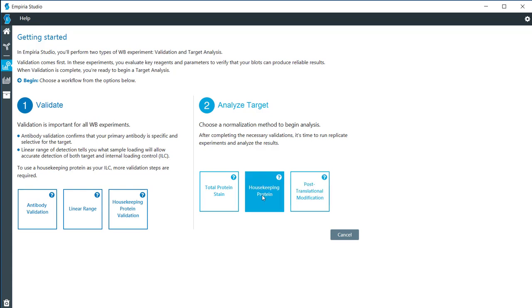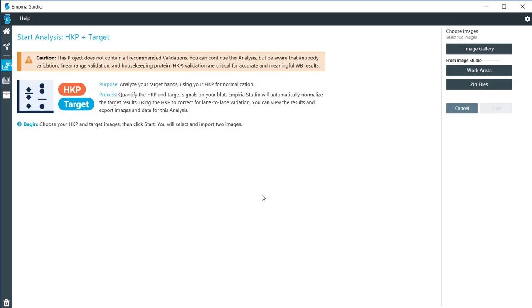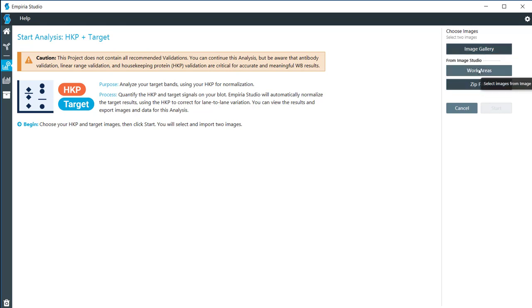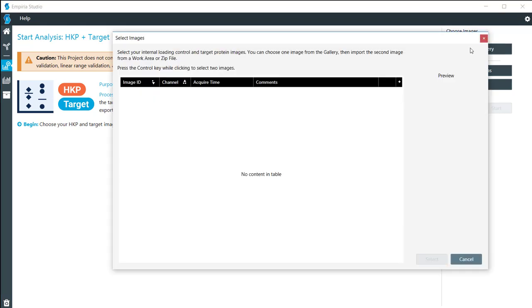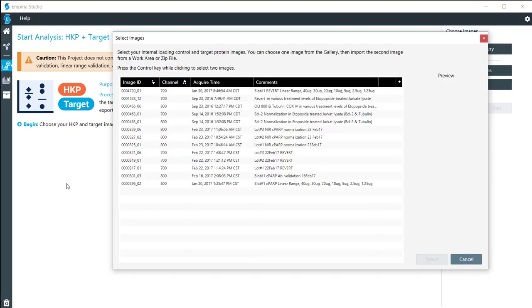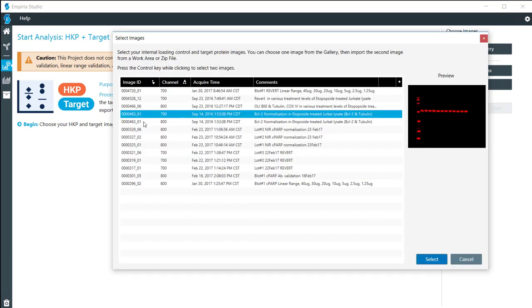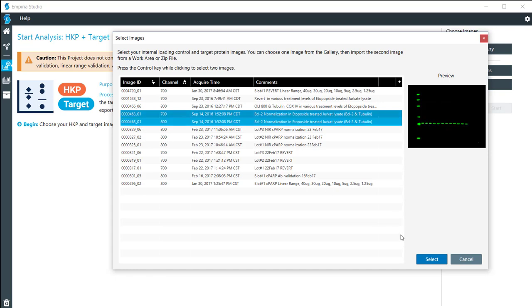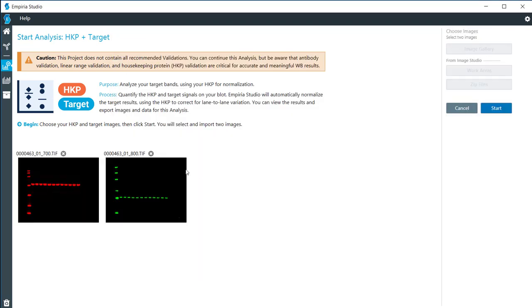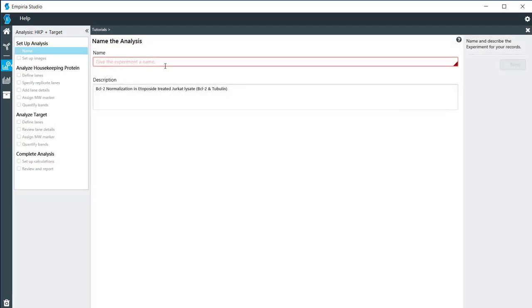I'm going to click on housekeeping protein right here. As with the other videos in this series, I'm going to click on the image gallery. But if you have images that you want to bring in from another work area on the same computer, or if you have zip files that you have exported from Image Studio, you can click on either one of those. Here I'm going to pull in image 463. I'm going to select that, and I can view my images right here and see that those are the ones that I want. So I'm going to click on start.